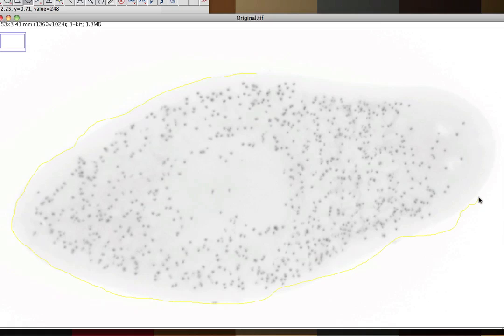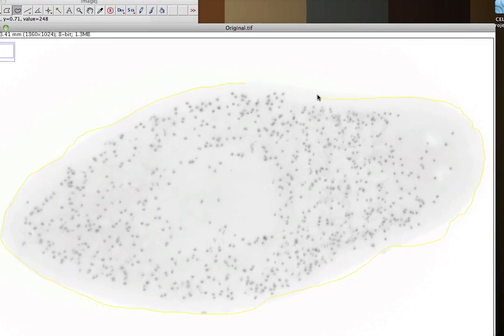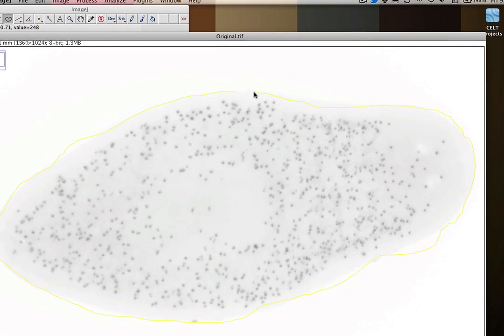Whoa, I really messed that one up royally there. Once we get back here, we'll join these together.